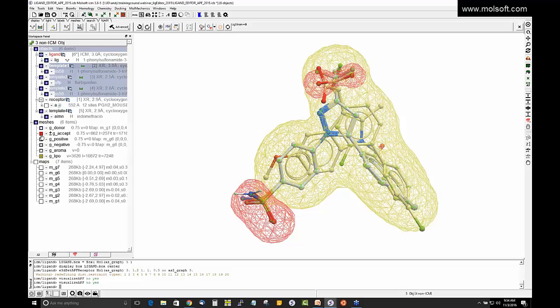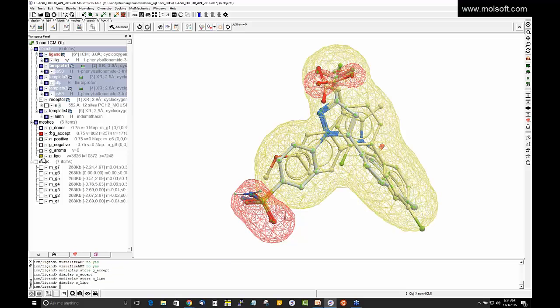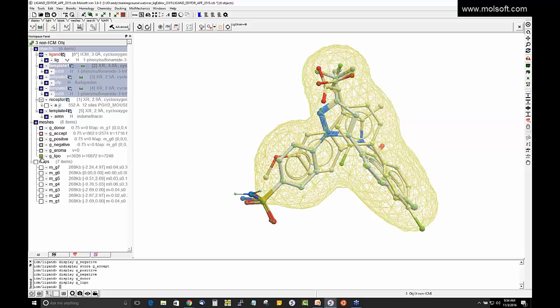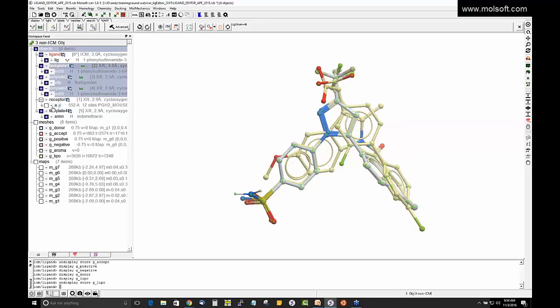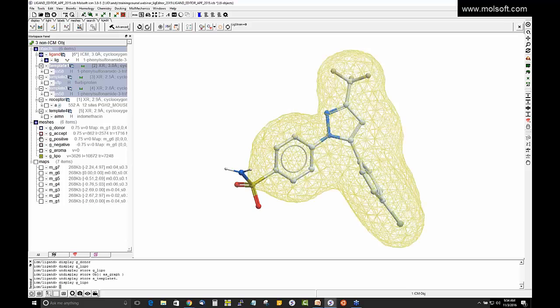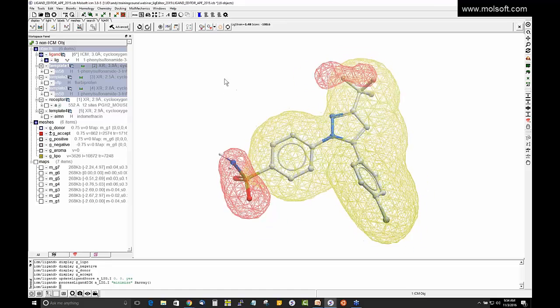So we have hydrogen bond acceptors, a lipophilic region, electronegative, so you can toggle these visualizations off. So now we can edit this ligand. This is the ligand we want to edit, and we can edit it in these fields. So in a similar way, you have a ligand strain. We can do a minimization to improve the strain, and fit into the fields.